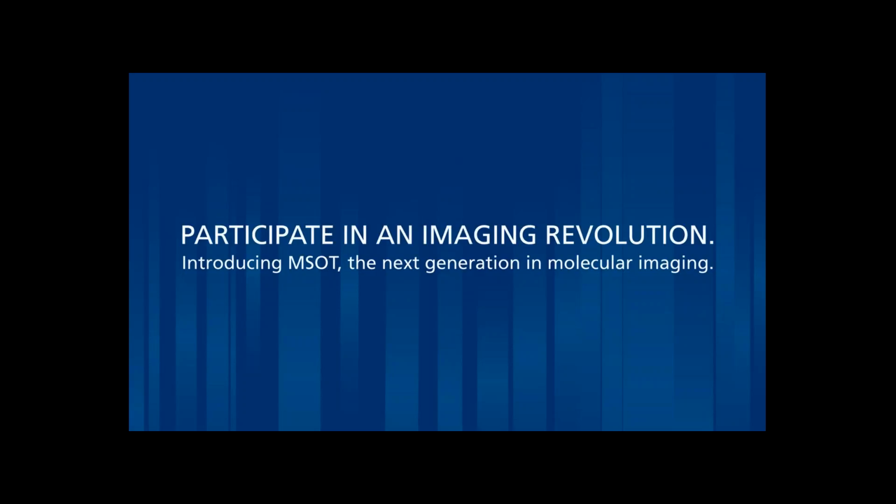A couple of questions on the preparation of the animals, maybe for Neil. Could you please explain how the mouse should be prepared for an in vivo experiment? Specifically, should it be shaved, and are black mice possible also? Yes, I can address this question. As with optical or ultrasound imaging, if hair is present on the animal, this is going to interfere not only with the light coming into the tissue, but with the ultrasound waves coming out.